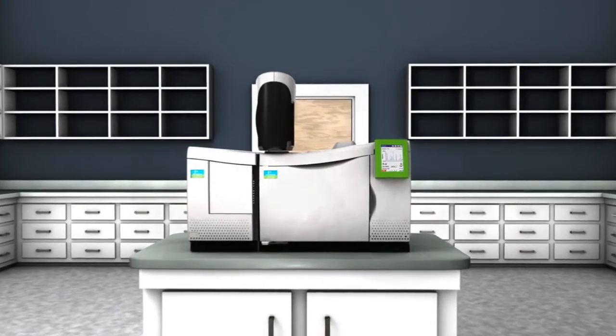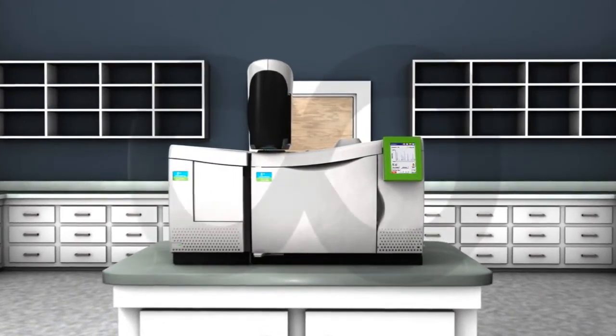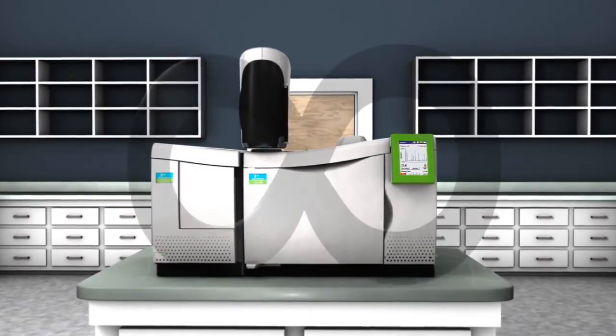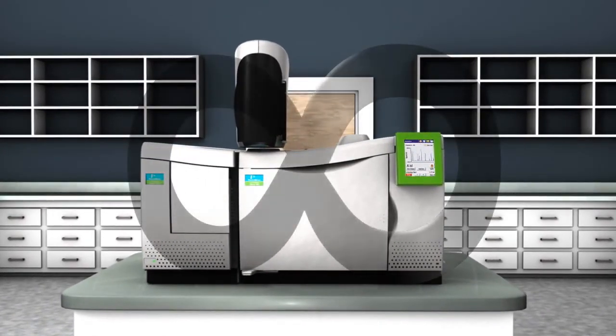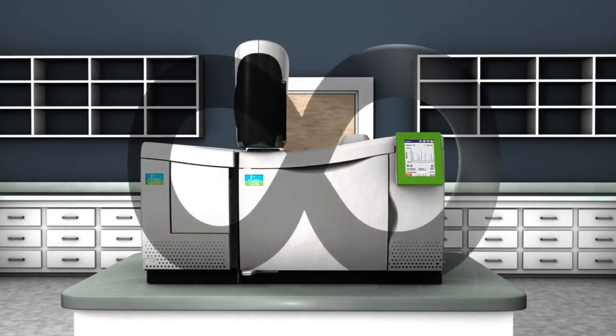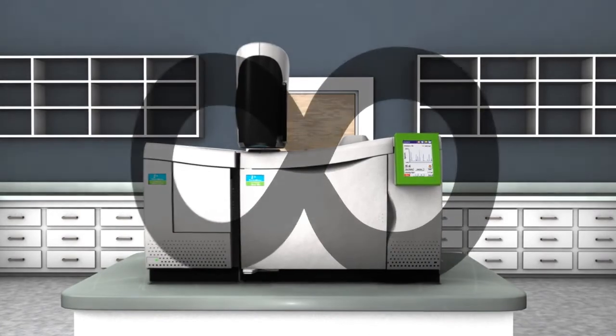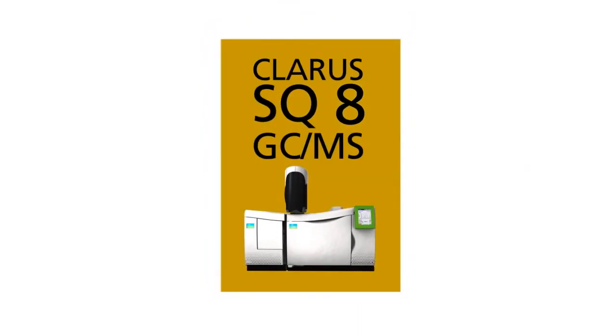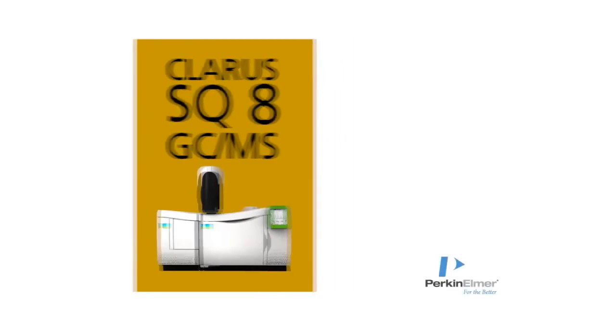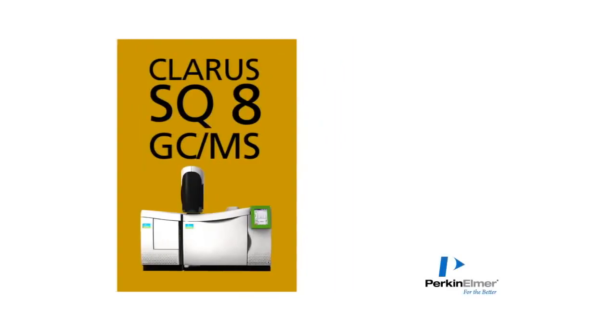Discover the infinite possibilities of an instrument that delivers never-before-seen levels of sensitivity and stability. The Clarus SQ8 GC-MS from PerkinElmer. The sensitivity and stability you need to succeed.